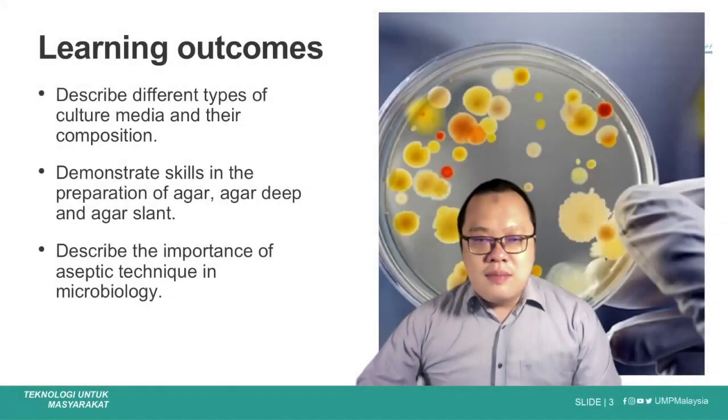The learning outcomes of this Lab 1 are: first, to describe the different types of culture media and their composition. Second, to demonstrate skills in the preparation of agar, agar deep, and agar slant. Third, to describe the importance of aseptic techniques in microbiology.